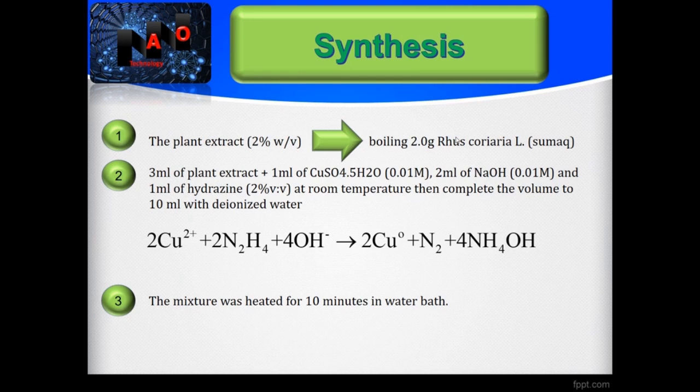Then the mixture was heated for 10 minutes in water bath. The solution color changed from faint blue to pale yellow and by heating became deep red.